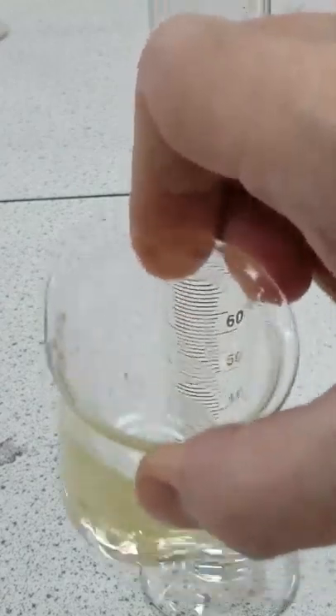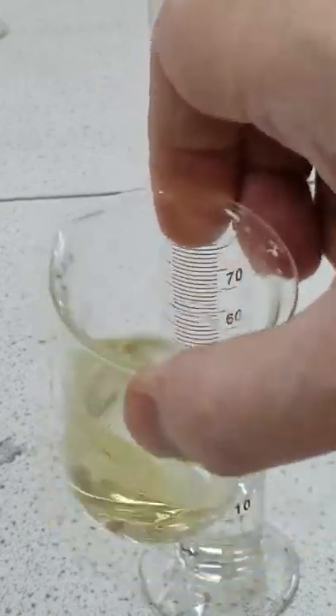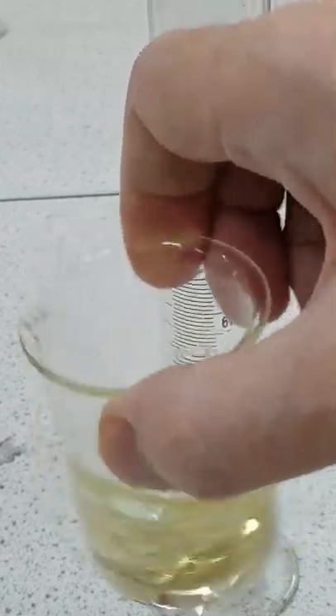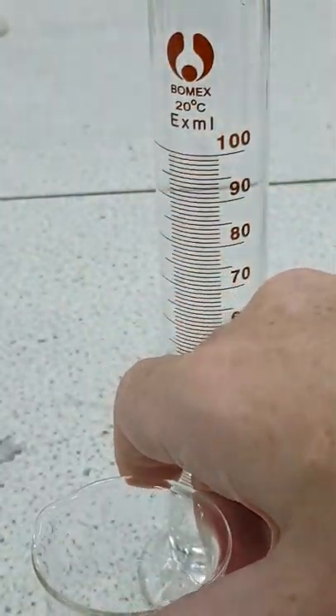About half of it has dissolved and you can see the solution has a pale yellow colour now. Just need a little more to go into solution — inevitably we might be left with a few specks undissolved. Most of it's gone; swirl a little longer and you should be able to get all of it to dissolve.